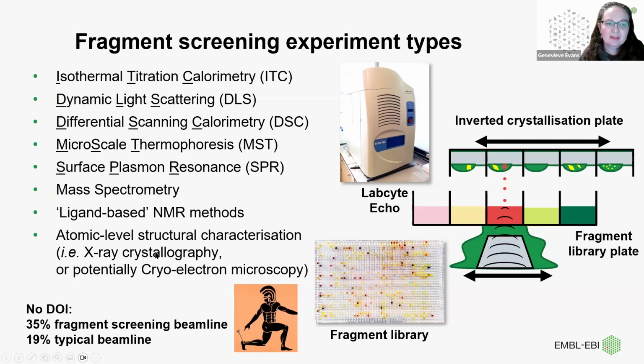In terms of thinking about X-ray crystallography and the methodology that's being used there, often what's happening is there's a crystal plate, and the crystal plate is having various chemicals, various fragments, essentially using sound to drive those chemicals onto the drop and soaking those fragments into the crystal and then collecting that data. And there's various beamlines that have been streamlined to do this. And one of the things we've noticed at the PDBe is that sometimes these structures will be deposited, but they won't necessarily end up with a publication.